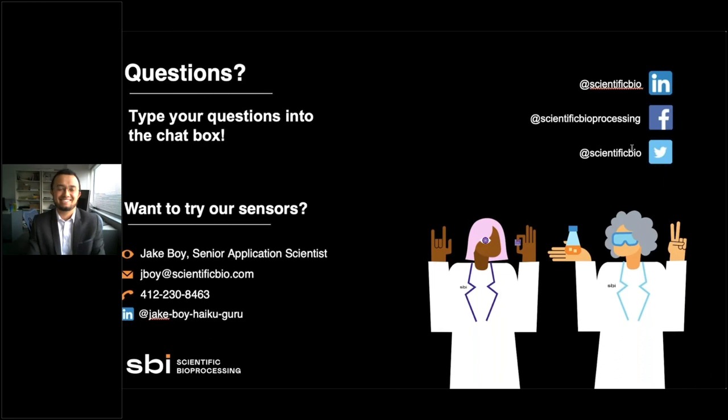I have another question from Natalia, and she says, based on the results from these experiments, what next experiments, areas of study are you evaluating? We are currently using this chip in order to study the interaction between colorectal epithelial cells and microbiota, given the fact that the microbiota is fully anoxic.